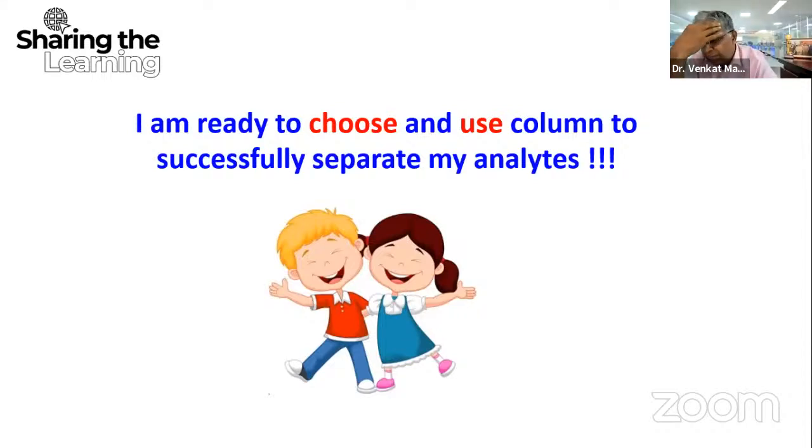per ml. Because when you make a solution, we normally use 5 to 10 micrograms of sample, not more than that, by weight. So there's a query from Mr. Tirumala. Please tell us the good column care procedure. Probably he wants to know what are the procedures to follow for good column care.